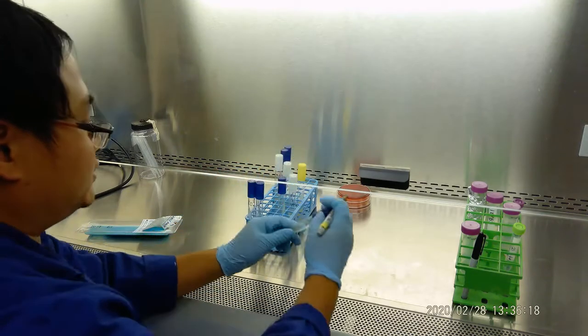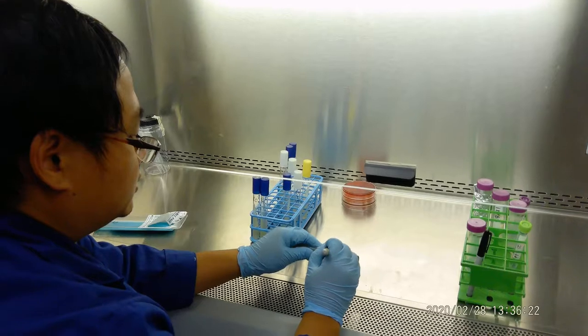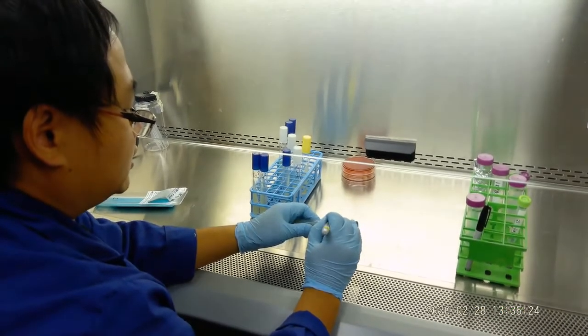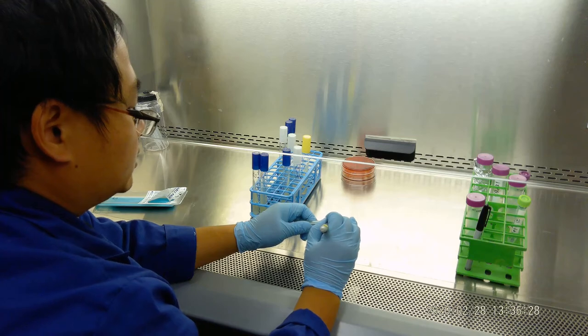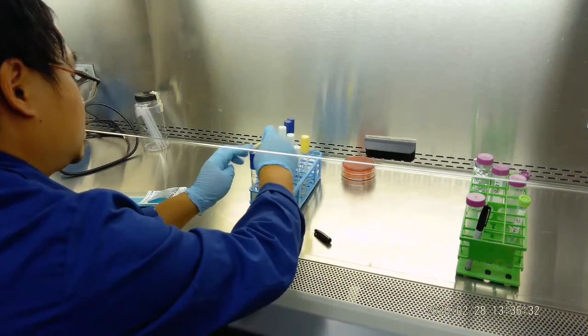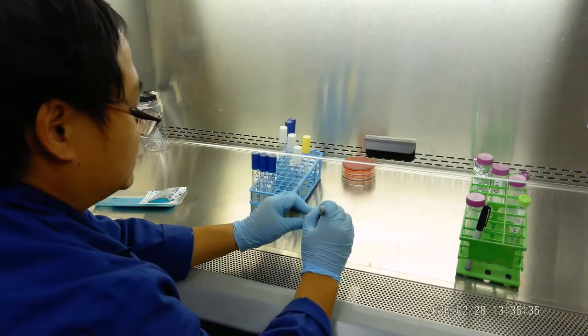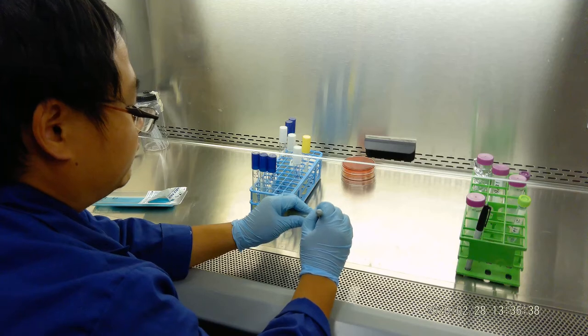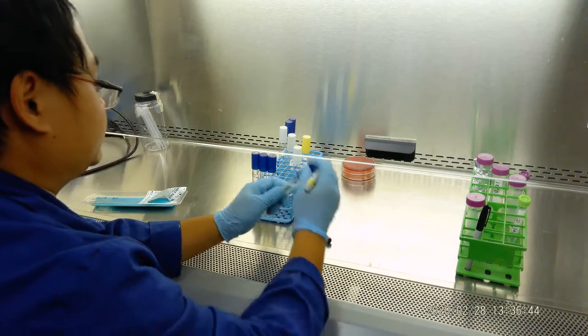Then we do 37 degrees Celsius. So it's E. coli, 37 degrees Celsius, and we do initial, date. Okay. Then the last one we put at 55 degrees Celsius. That will be E. coli, 55 degrees Celsius, initial, date, and bench number.